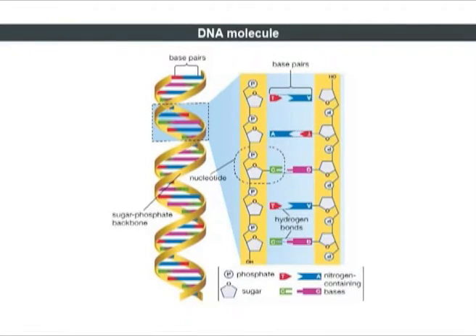The term DNA sequencing refers to methods for determining the order of the nucleotide bases adenine, guanine, cytosine and thymine in a molecule of DNA. A wide variety of DNA sequencing technologies have been developed since the 1970s, resulting in gains of many orders of magnitude in speed and accuracy. The first DNA sequence was obtained by academic researchers using laboratory methods based on two-dimensional chromatography in the early 1970s.